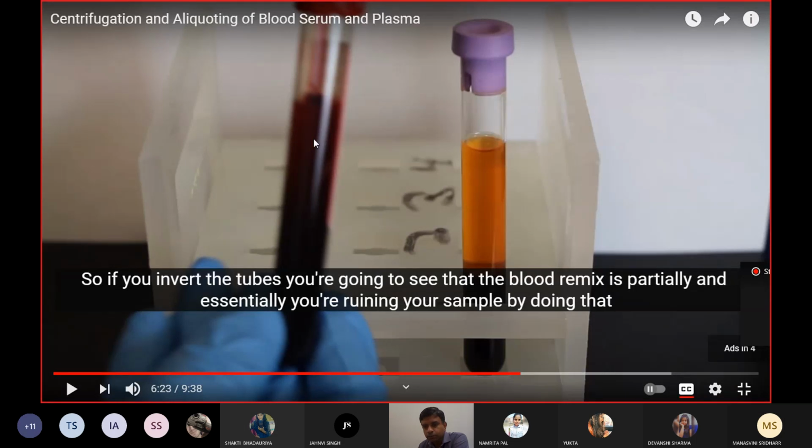So again, after this step, centrifugation, you have to carefully work with the sample, right? If you have to remove this serum with the autopipette, you have to do it very carefully, okay? Otherwise, specifically at this point, what happens is you will also pick some of the blood cells, okay.